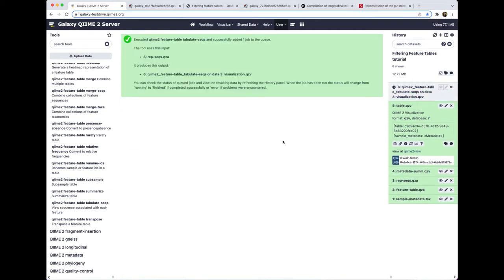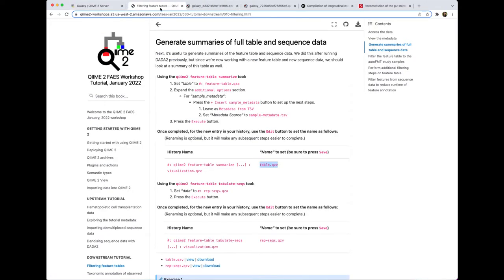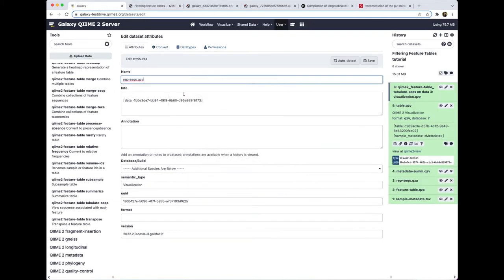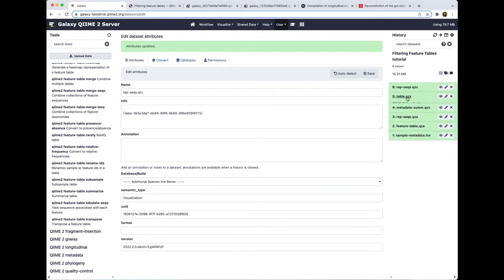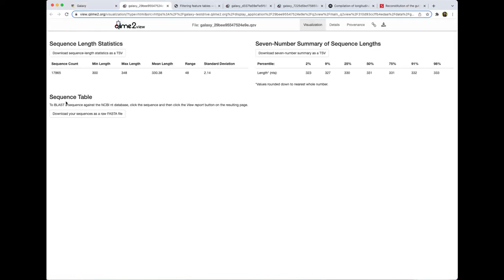That's going to take a little bit of time to run. Great, and of course the next step is we're going to edit this dataset's attributes and rename it. Our tutorial tells us that we want to call this rep-seqs.qzv. So we'll copy that, paste that in here, and save. And again, because this is a .qzv file, we can take a look at this QIIME 2 visualization for each sequence.